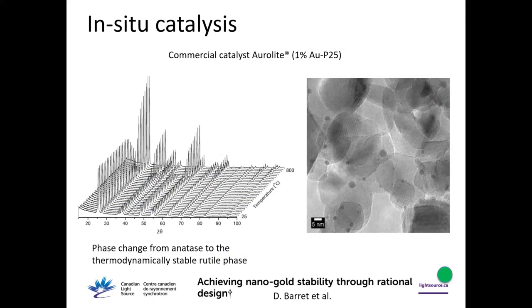And this is an example of a catalyst study using this capillary cell, where we control the temperature. In this particular case, we flew hydrogen because we are starting from the beginning. We start from the impregnated substrate with the precursor salt, and by flowing hydrogen, we get the reduction of the gold salt, and we see the forming of the gold nanocrystals that are the catalysts.